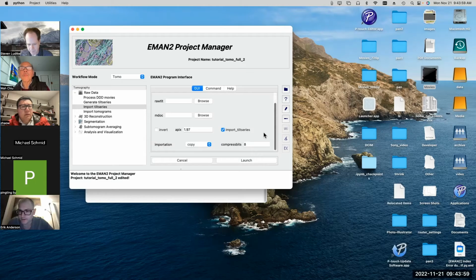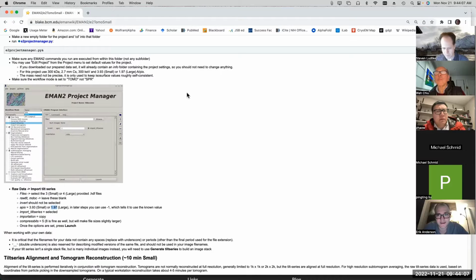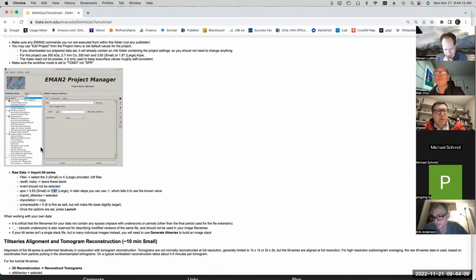Actually, so Dr. Luck, yeah, sorry, can I? I was helping Dr. Baldwin and Robin with reconstructing a tilt series, and I noticed when I just did not send the MDoc, they reconstructed correctly. So I'm assuming what happened is what you're saying, that it's not necessarily going to be sorted in the right order. If you go to the Browse tab and select all the MDoc files you need, and then go to the Browse tab for the tilt series and select all the tilt series you need, they're not necessarily going to be read in the same order. Is that what you were essentially saying?